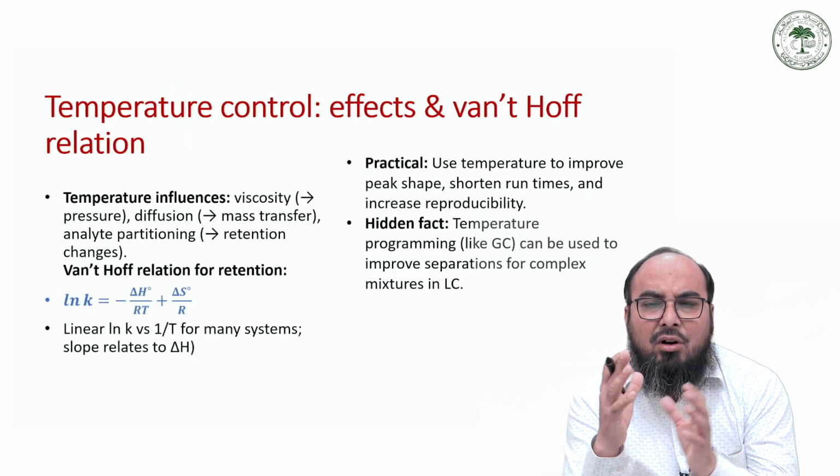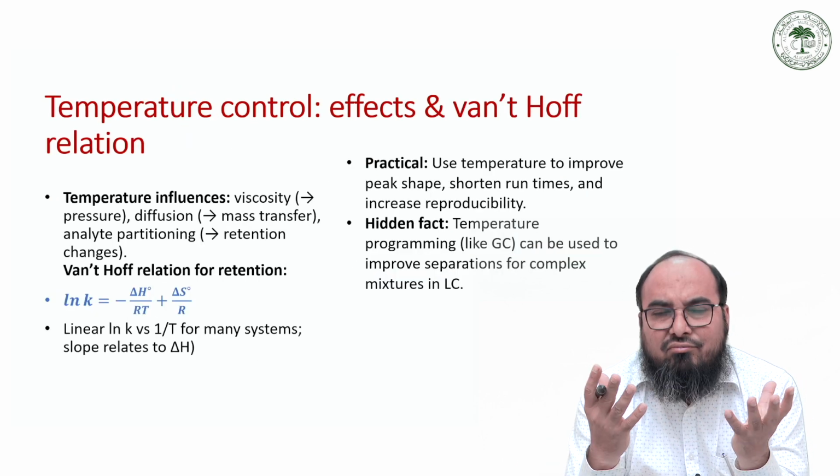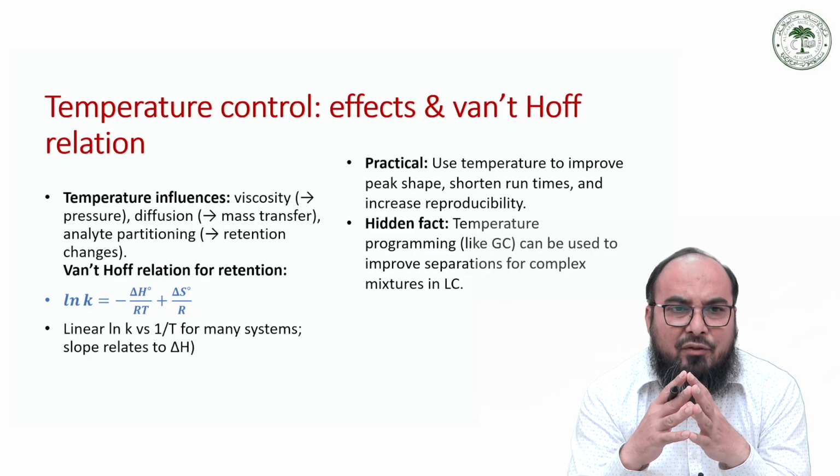Now, temperature control and its effect in terms of the Van 't Hoff relation.